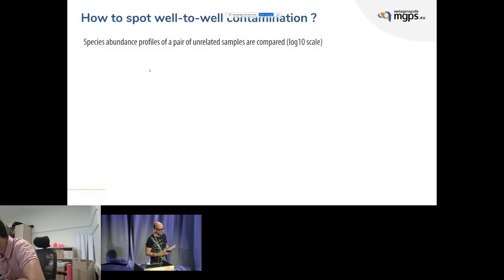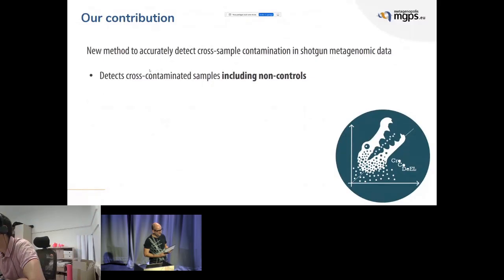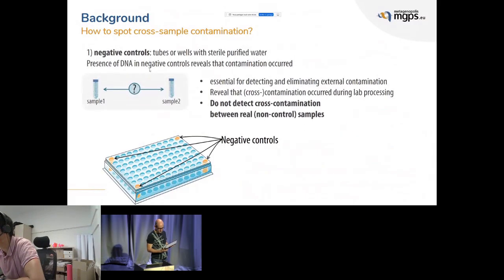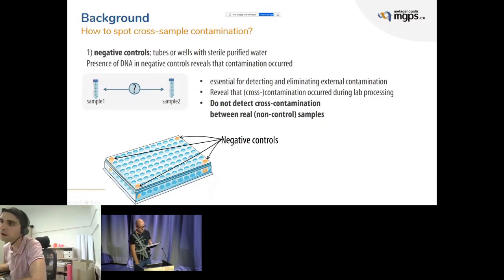Yeah, personally, I think that is the most likely scenario. Anyway. No, actually, when you work with plates, you can have a lot of cross-sample contamination because, for instance, you seal the plates with a film, you remove the film, and there are microdroplets that are spread everywhere.